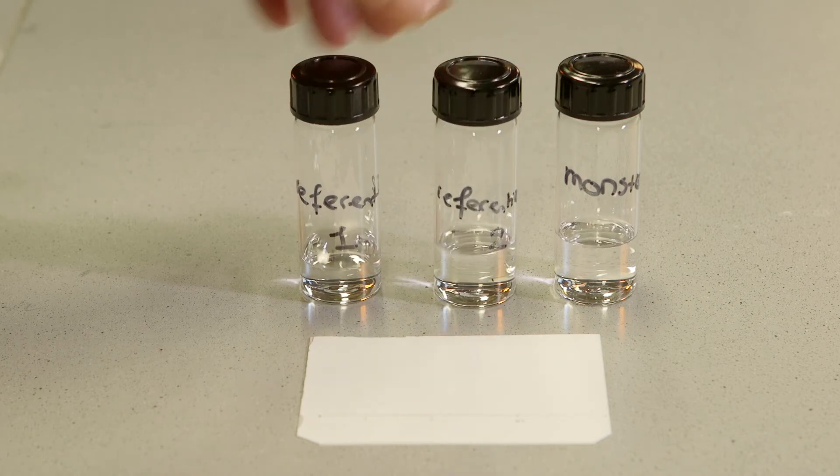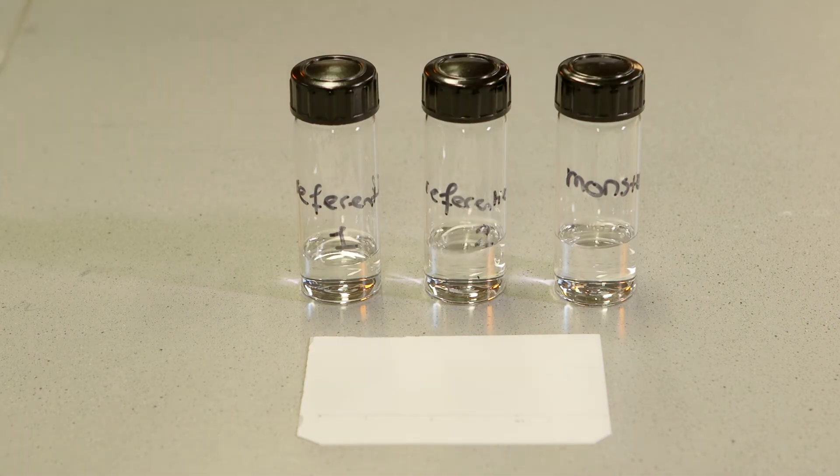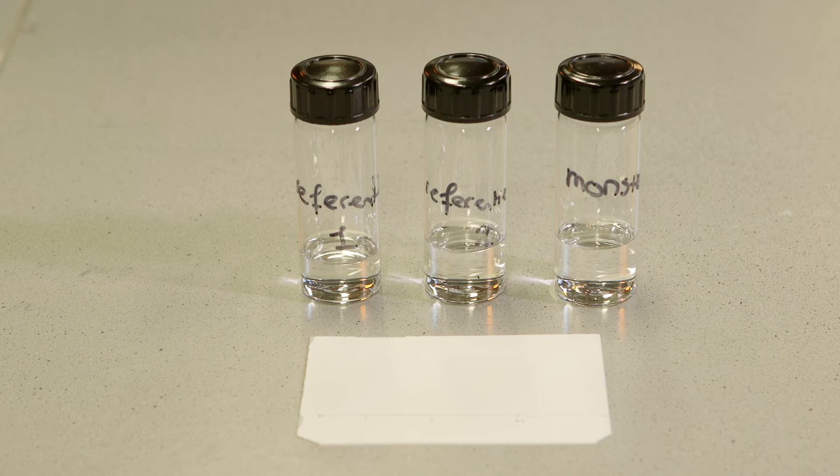The corners of the TLC plate are cut so that the solvent will rise uniformly. Dots are drawn on the line and are numbered to be able to identify the samples and the reference solutions.